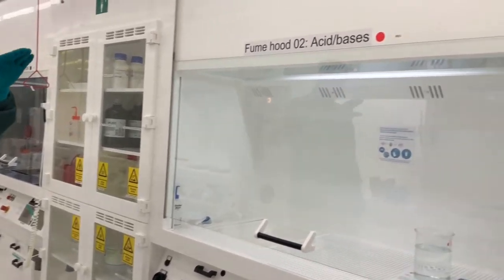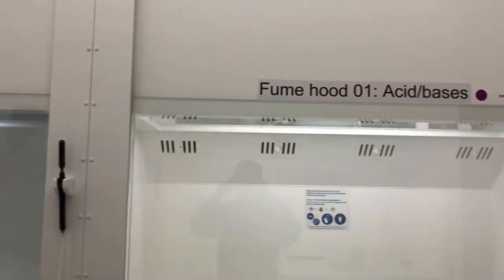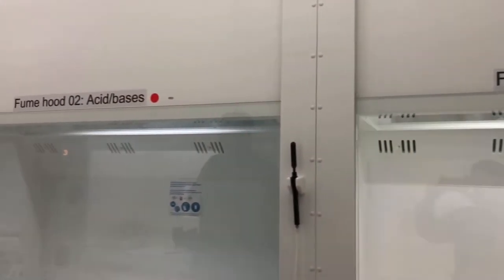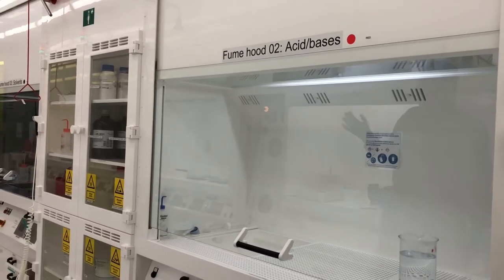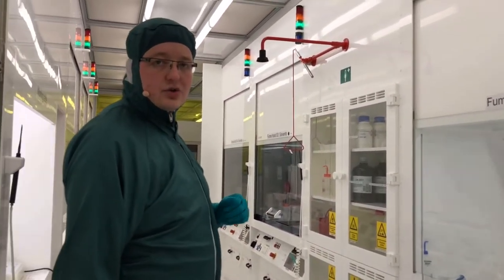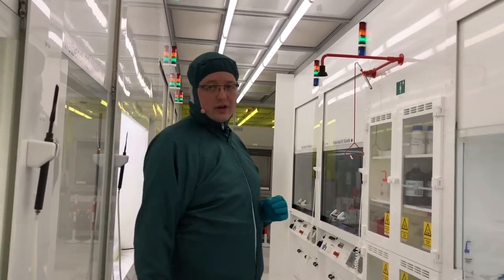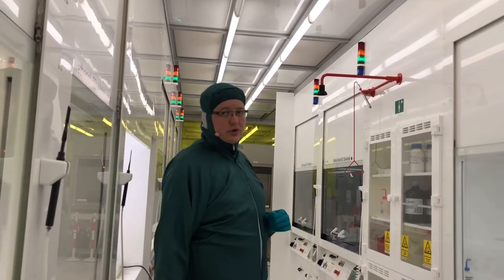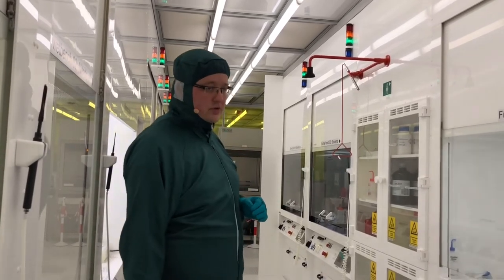All fume hoods have been named, and this is also the name they have in lab manager. The name tells you something about the intended application of the fume hood. Depending on which process you would like to run, certain fume hoods are dedicated to certain types of processes, and you can find more information about this in the manual. For instance, if you would like to dice wafers, we have a dedicated fume hood for this process.